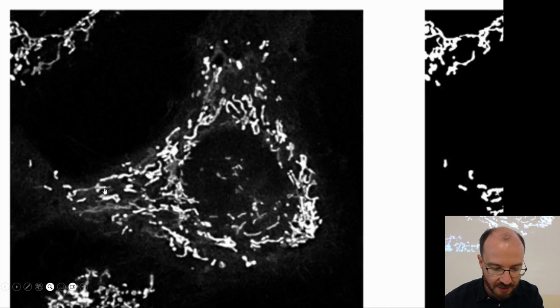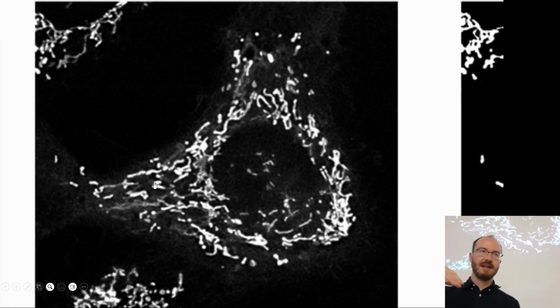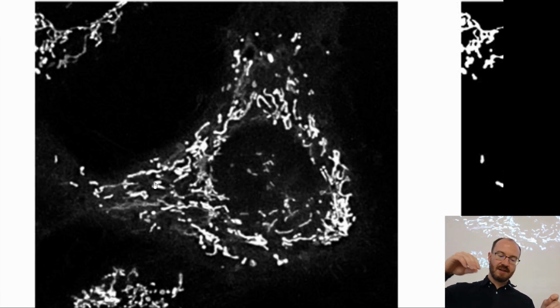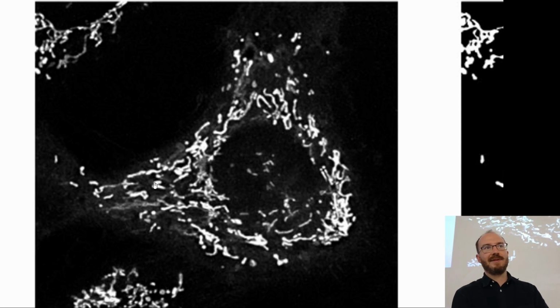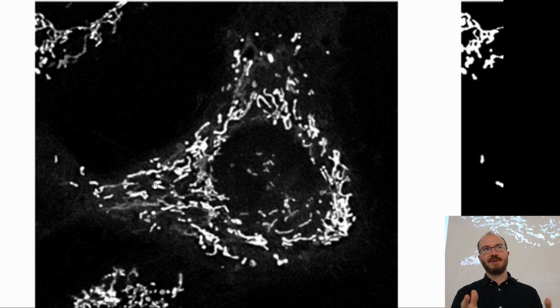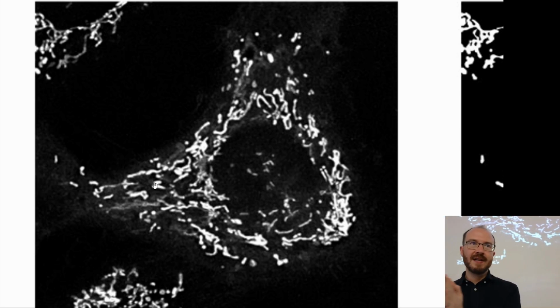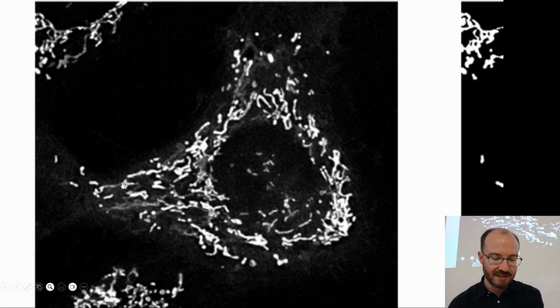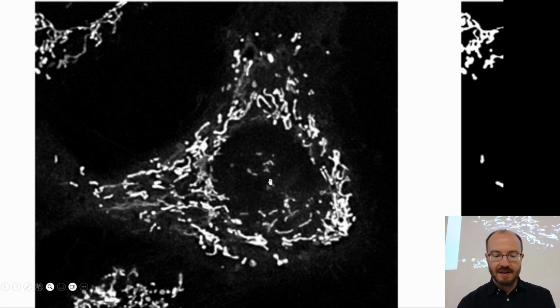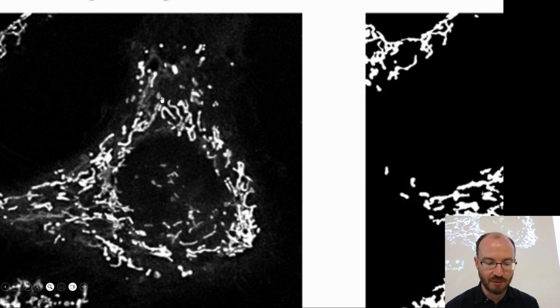So for example, I've got this strand there. It's one strand, but it has this low dip in intensity. So it starts bright, then it goes dimmer and it goes brighter again. And that's just inherent. This is actually how it looked in the acquired image. But when I segment, this must be one continuous thing. Now what do I do when I segment, when I basically threshold? I choose where is the best intensity value to consider this foreground or background. So now I must move my intensity value all the way down just so that that is considered one continuous structure.